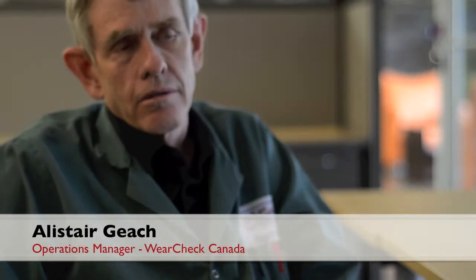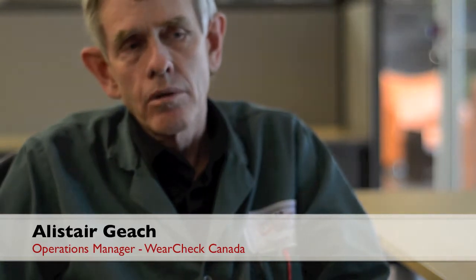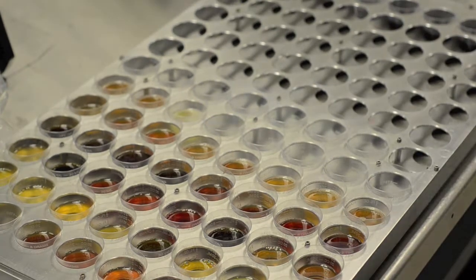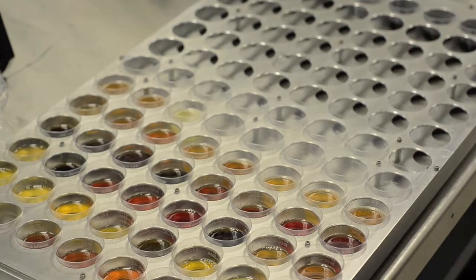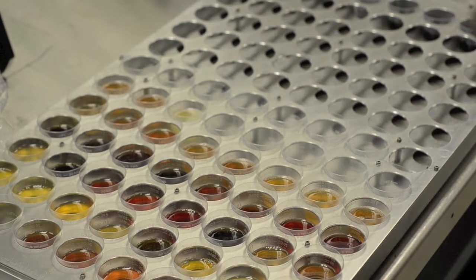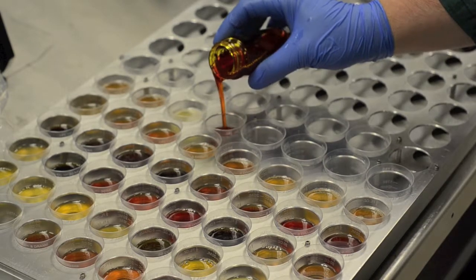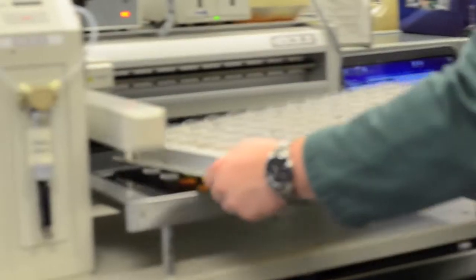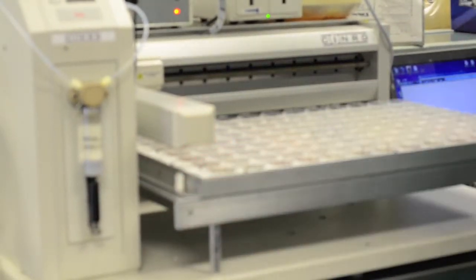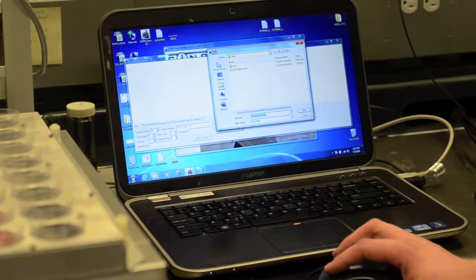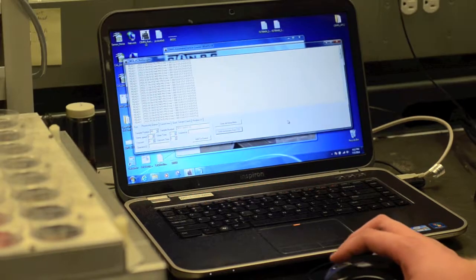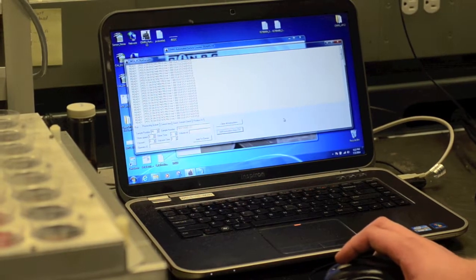The samples are poured into sample cups after having been homogenized. Typically, 15 mils is poured into the cup. You can change the volume based on the viscosity or the thickness of the sample. A completed tray is put onto the system. The batch file is loaded into the software. And then the run is initiated.